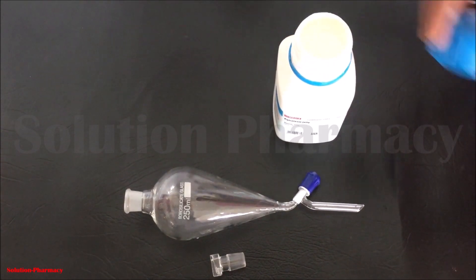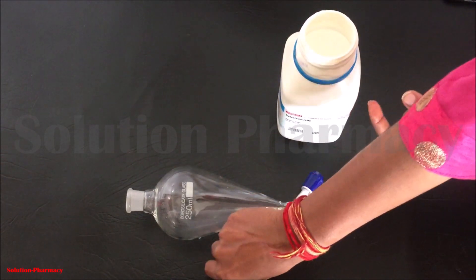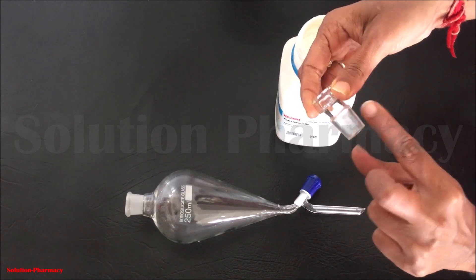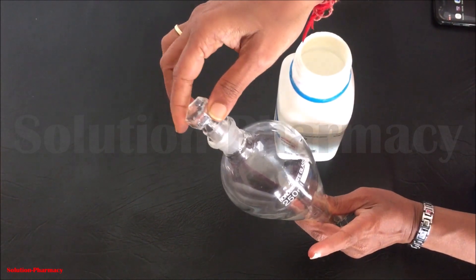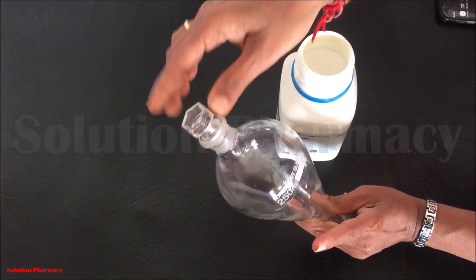If the stopper of the separating funnel is loose — not tightly fitting the joint — then we have to grease the stopper. Here we have taken a very small amount of petroleum jelly for greasing. Put a thin layer of petroleum jelly on the surface of the stopper and then attach the glass stopper to the joint.